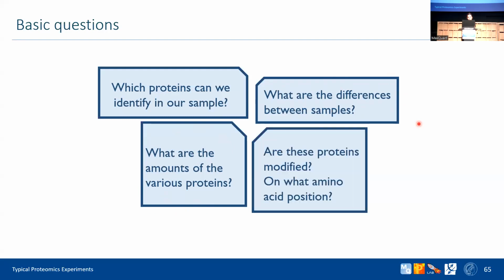Another question that we can ask is about the modifications of your proteins. What kind of modifications you have in your sample, and you also want to quantify these modifications, and also in which position as well.